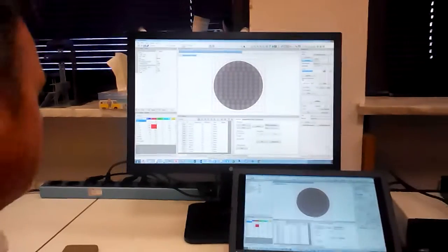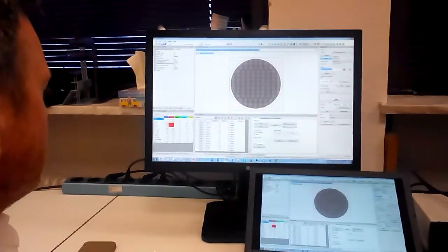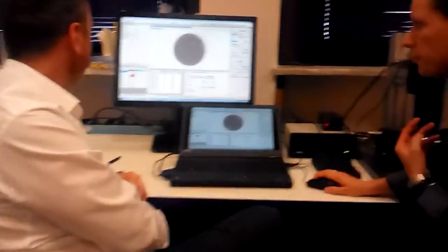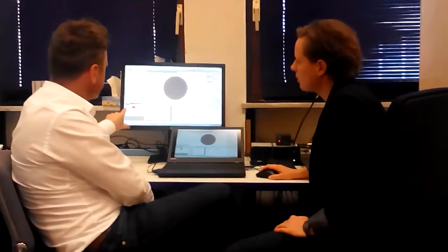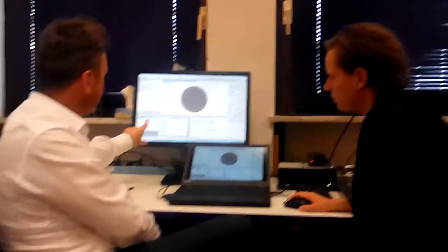So this window shows you the particles sorted according to a standard. In our case, it's the VDA standard. Just to reiterate, the VDA BD19 standard is saying that in the red column here, the maximum, and this is why it's turned red now, in the 50 to 100 micron class size, the threshold limit is 250.